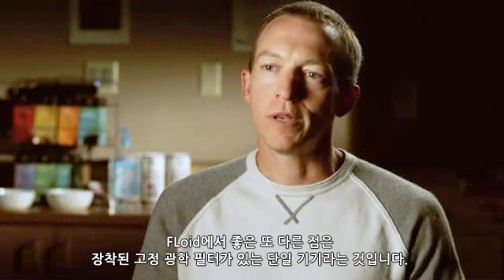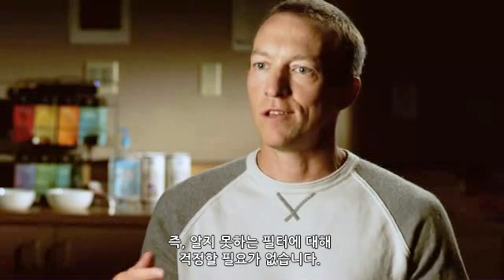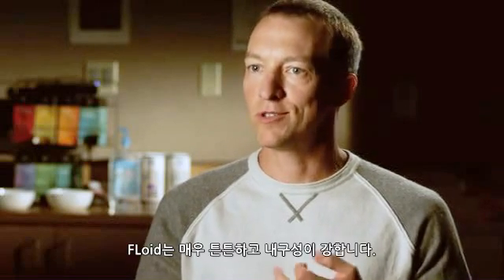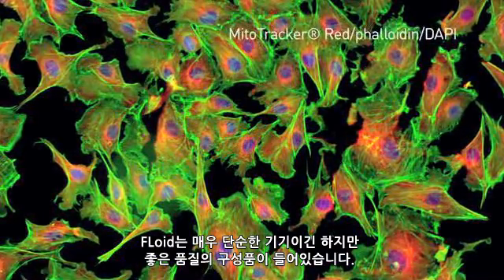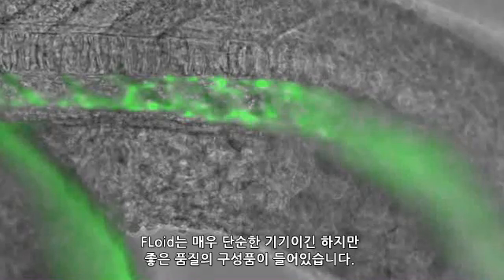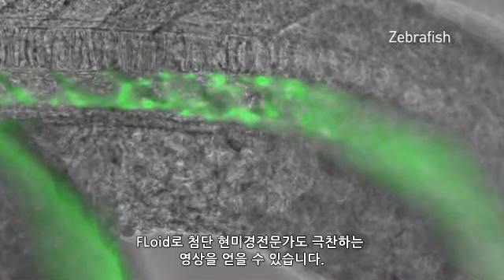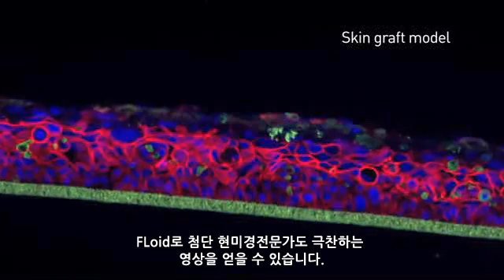With FLoid, we used a single objective with fixed optical filters in place, which means no frustrating aspects of filters being moved without your knowledge. It's also very durable and super robust. While we made FLoid a very simple instrument, we also put high-quality components in there — including a high-quality 20x objective. Even the most advanced microscopists have commented on the excellent images they've captured on FLoid.